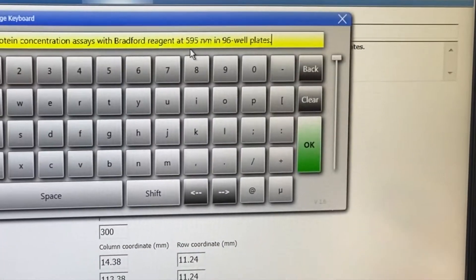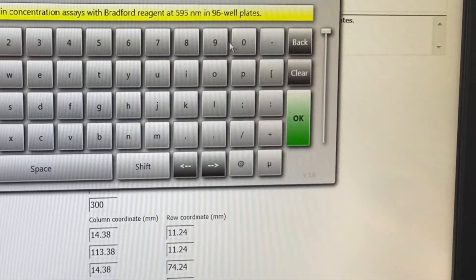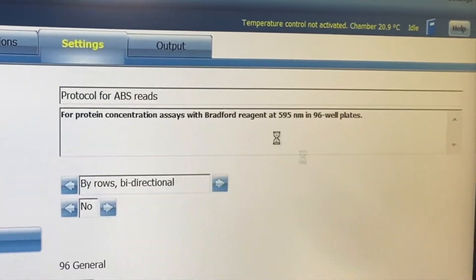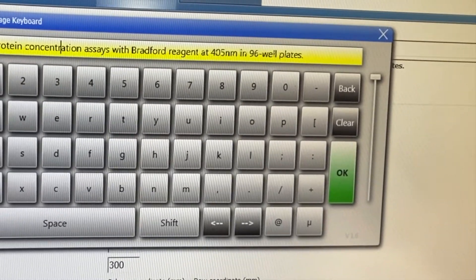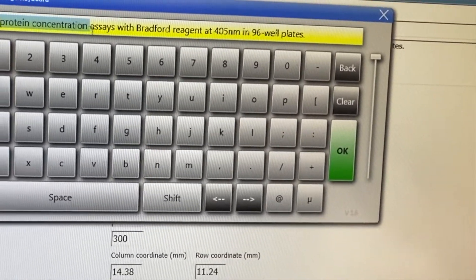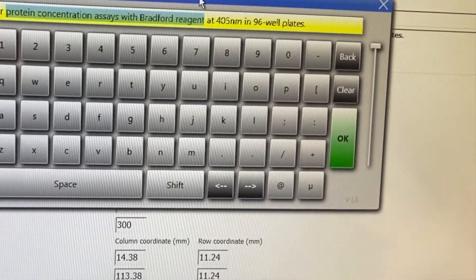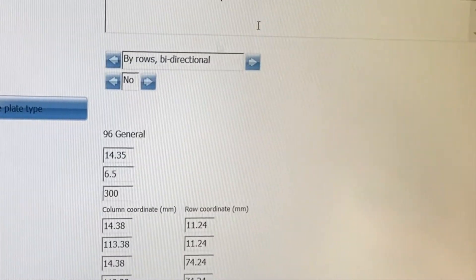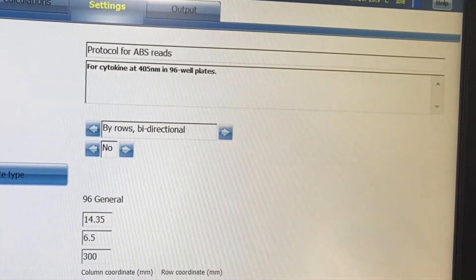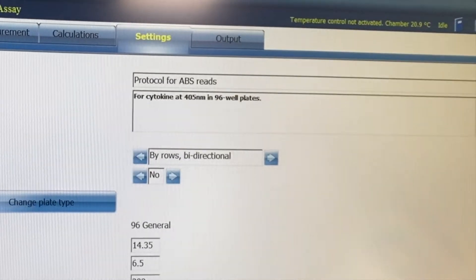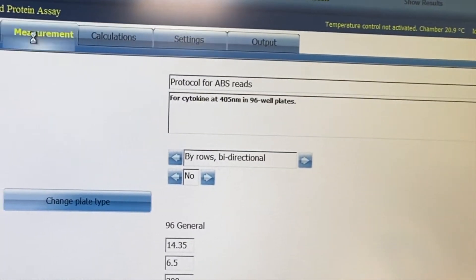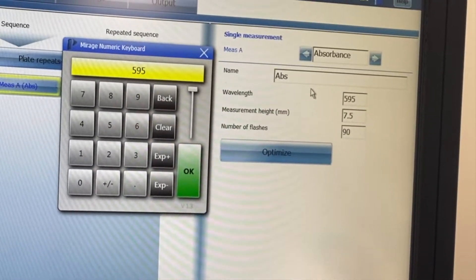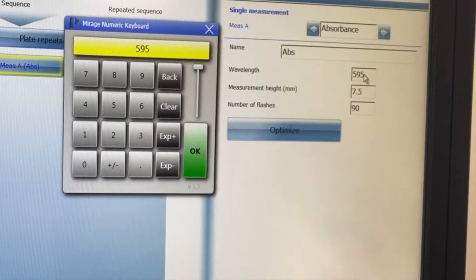You can put instructions here as well. Say this read is not at 595nm but you're doing an absorbance read at 405 nanometers, and it's not a protein concentration measurement but some sort of cytokine measurement — just name it as you need, for example 'Cytokine Measurement.' Now it's ready for your specific assay. We copy something that is absorbance-based, name it for ourselves, and then change the specific absorbance wavelength.